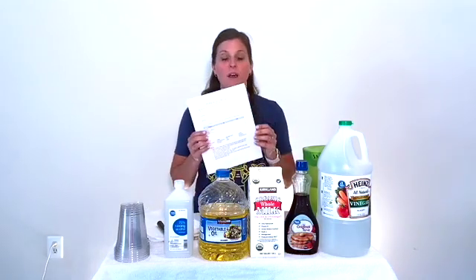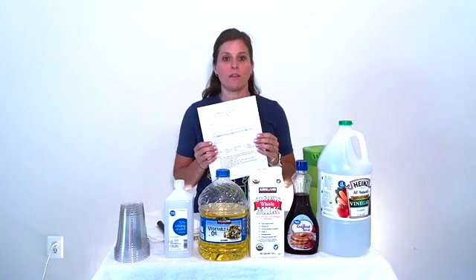Today we're going to do the experiment mixing liquids with water. What you need to have first is your lab sheet. I've printed mine out, but if you have it pulled up on the computer while you're watching, that's fine as well.